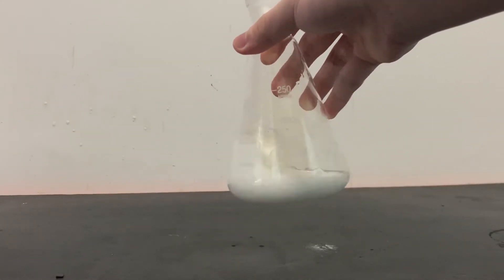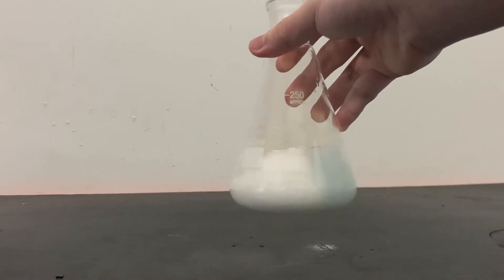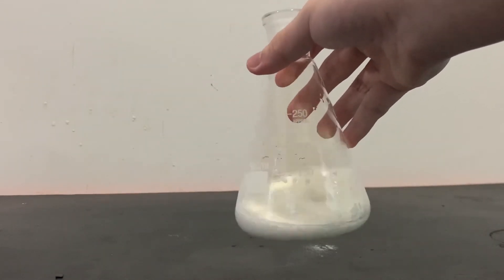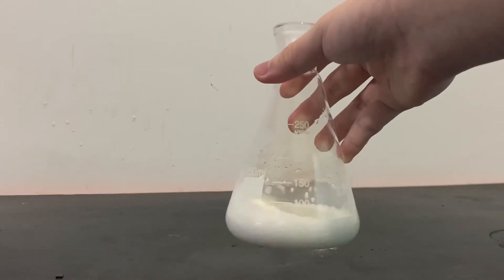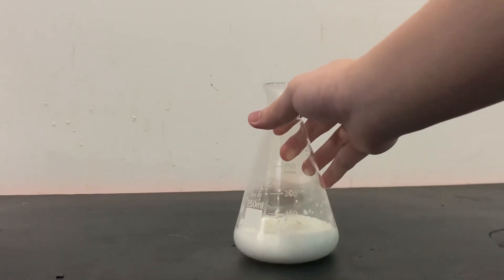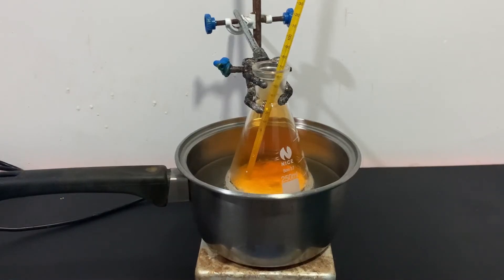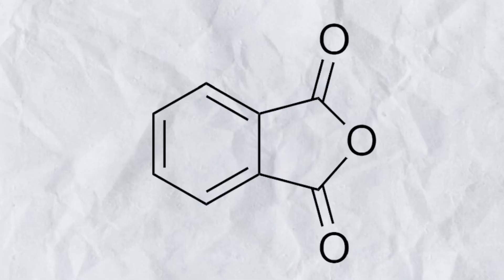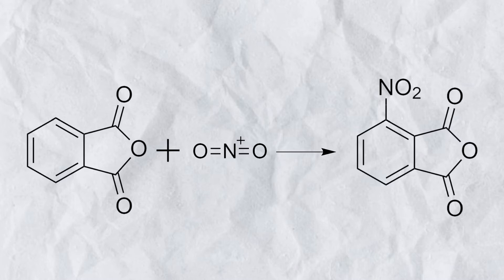After all the nitric acid is added, I swirl the flask just to make sure everything is mixed. I will then heat the flask in a boiling water bath for two hours. The phthalic anhydride reacts with the nitronium ion, which nitrates the third position of the aromatic ring.